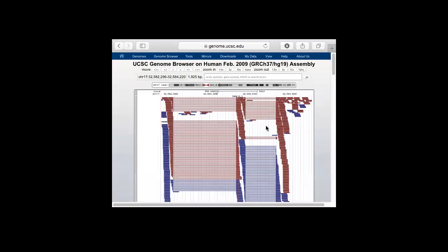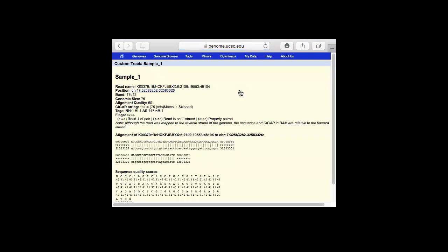So now you're seeing our sequencing data being aligned here. What I provided to the software is the BAM file. It's actually a link to the BAM file, okay? Let me go through this and I'll tell you how this works. You can see that this is an original annotation. There's an exon here, and then you see that there are many reads here. If you click on each one of these, it actually goes to this read.